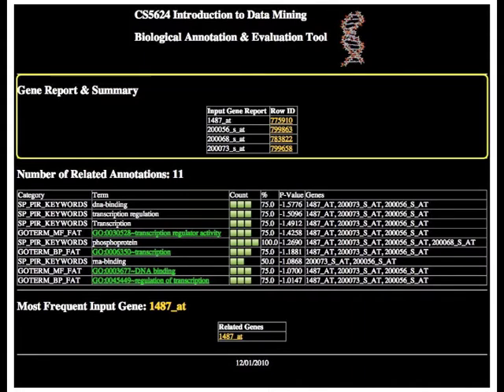Due to the large number of databases and associated IDs, the conversion of gene identifiers is one of the initial and central steps in workflows related to genomic data analysis. In this project, we use the TCGA genomic data, or Affymetrix ID. In order to retrieve related messages, we convert the Affymetrix ID to an Entrez ID and DAVID ID. The left-hand side shows the Affymetrix ID format, and the right-hand side is a DAVID ID format.